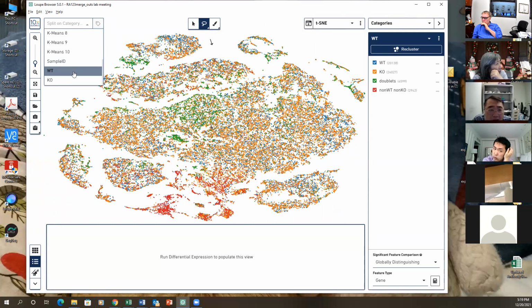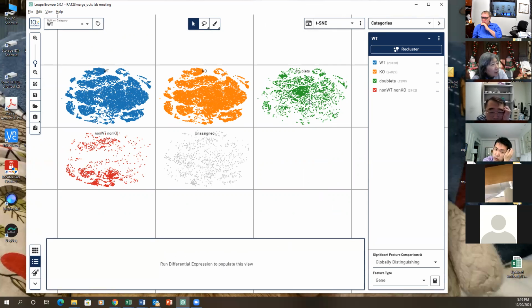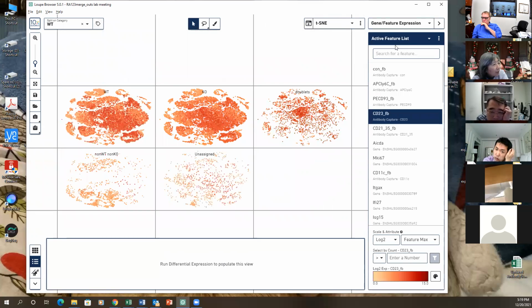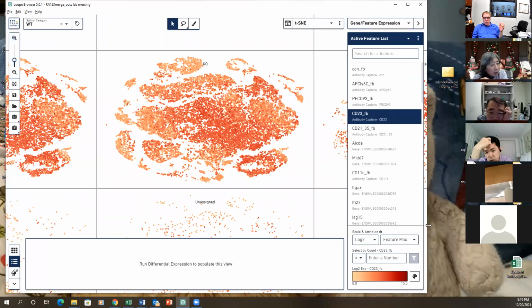And for WT, you want to separate by individual sample again, right? No, not now. Right now we just take a quick look. That's what we want. Now we can look at the genes based on sample, WT and knockout. Then we can go through every one of them. Exactly, now we can compare. But we don't worry about the other one. We really just worry about these 2.